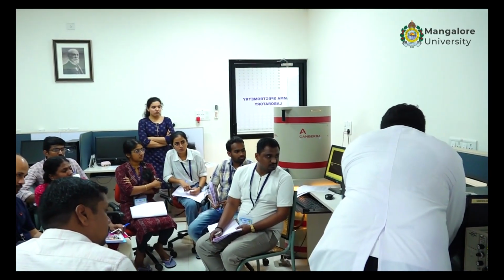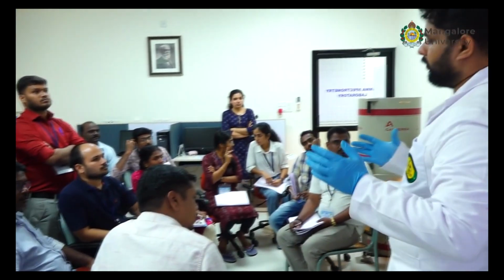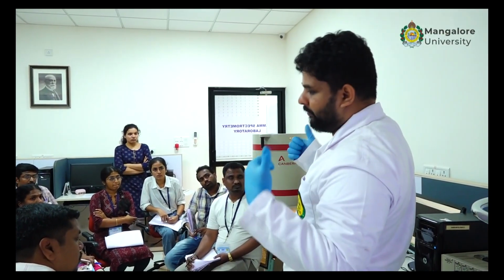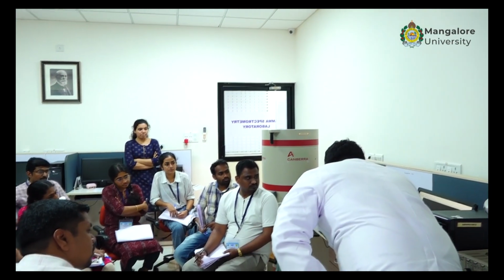So, can you see the difference between HPG and sodium iodide? The main difference over here is the channel difference. When I got the cesium peak in HPG, the resolution was so good that I used channels from 658 to 663, around 5 keV, to get a proper peak, correct? Here you can see that my left marker is at 581 and my right marker is at 742.